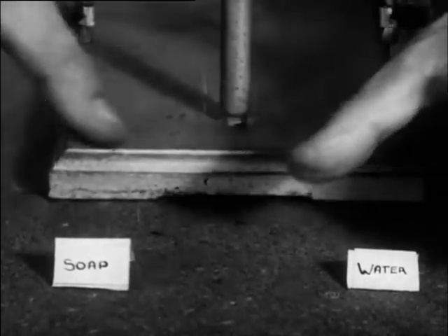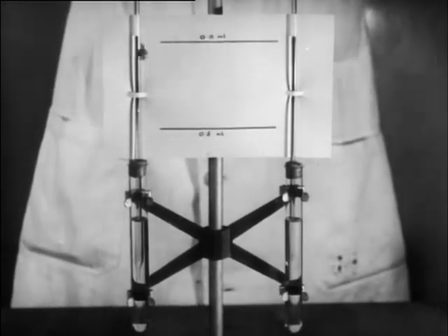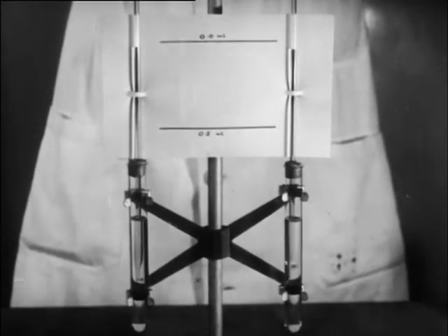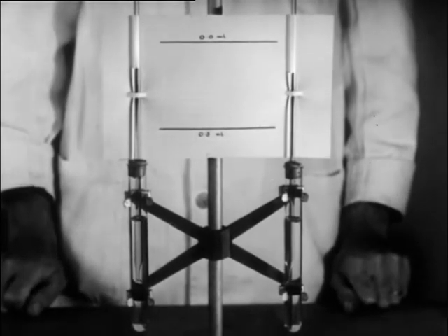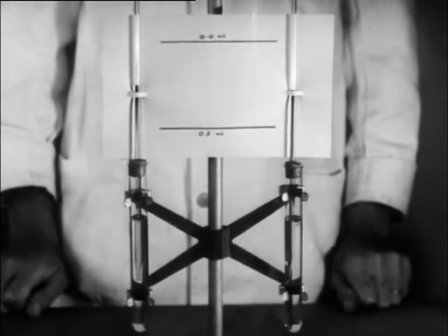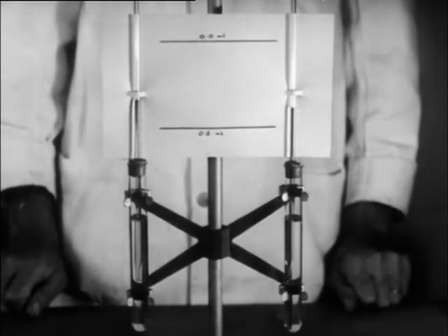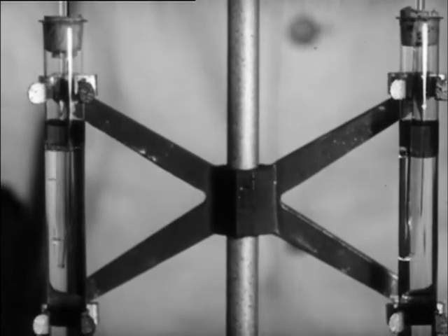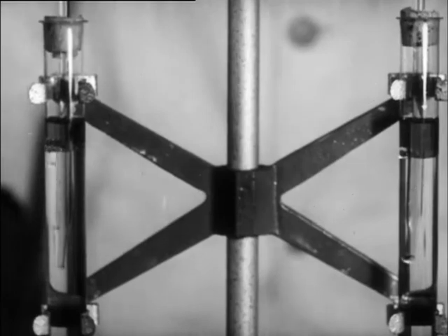To promote emulsification, that is the breaking up of one liquid into globules in another, one must reduce this interfacial tension. This is the function of the emulsifying agent and may be shown simply by the size of drops formed when oil drips from two similar tubes into water and soap solution respectively. The drops formed in the water are visibly larger than those formed in the soap solution. This is due to the effect of the soap in reducing the interfacial tension.